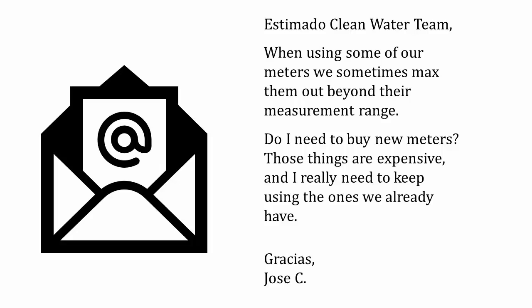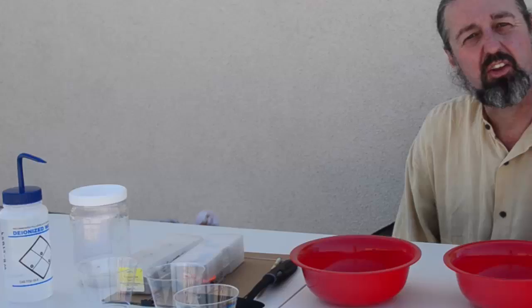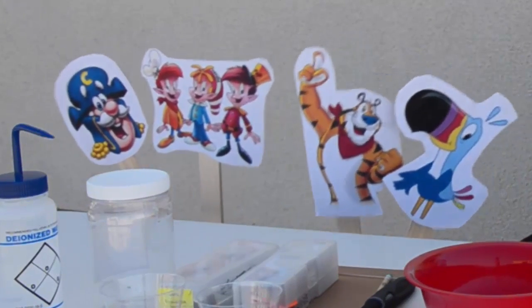The answer to both of these questions may be the application of a serial dilution. Today, we're going to perform a serial dilution. Not that kind of cereal, guys.